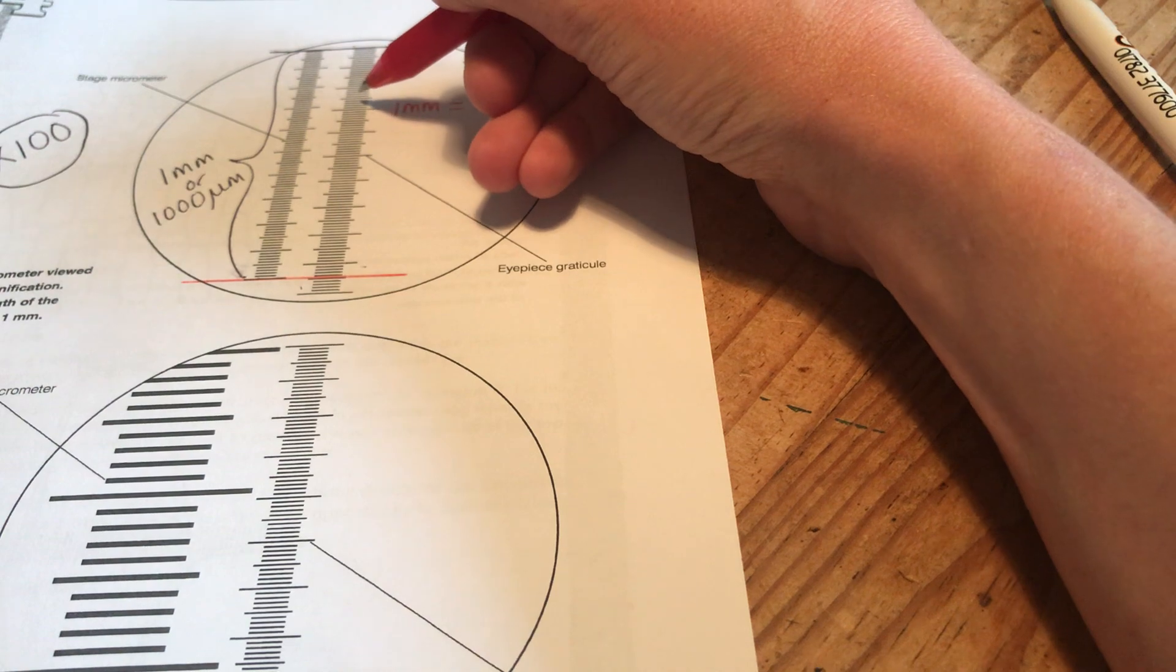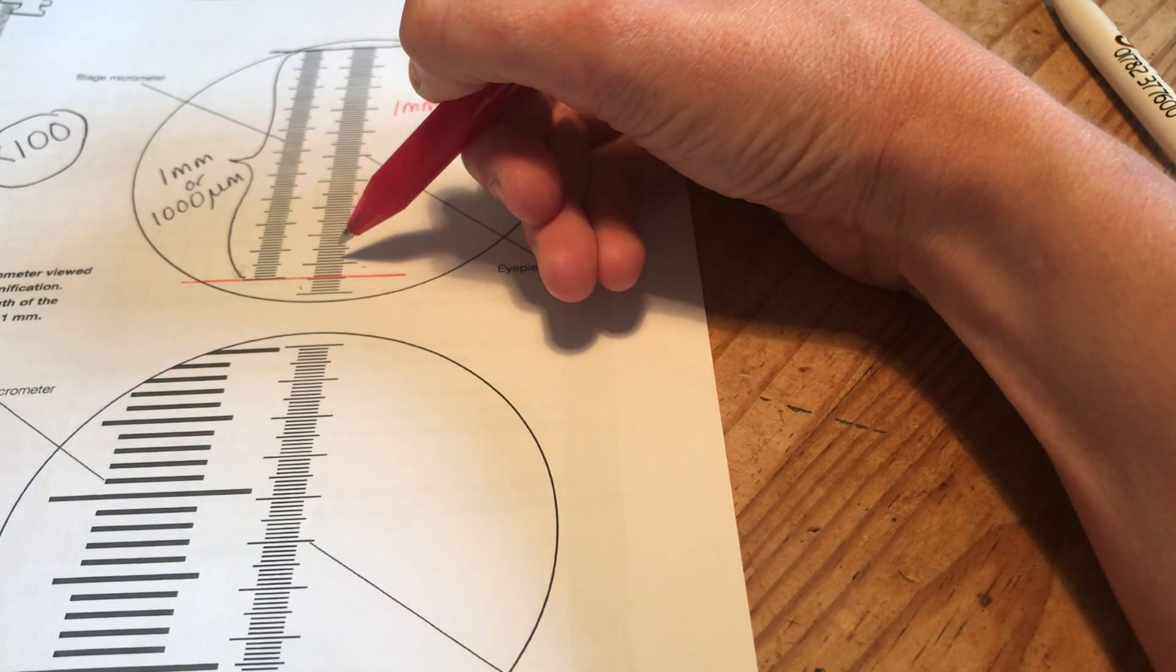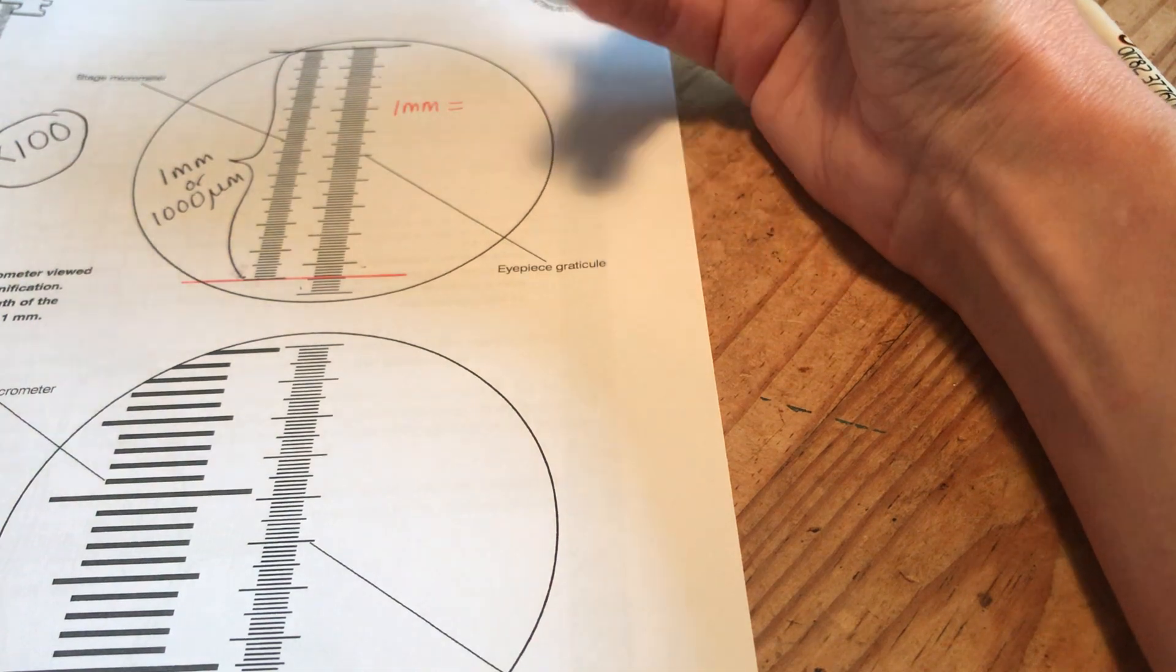So 10, 20, 30, 40, 50, 60, 70, 80, 90, 94 little lines.